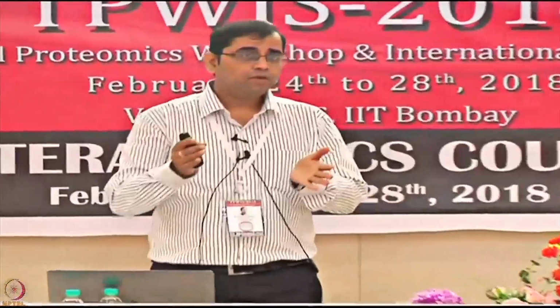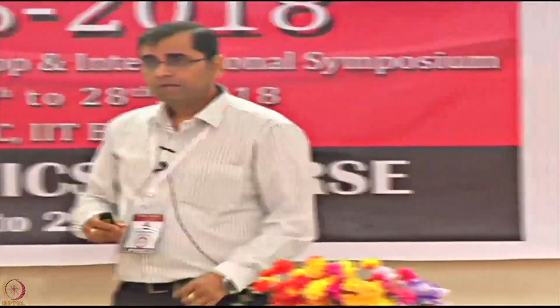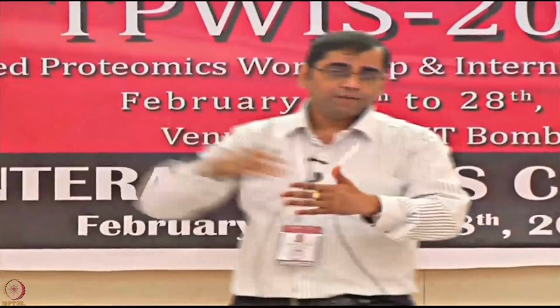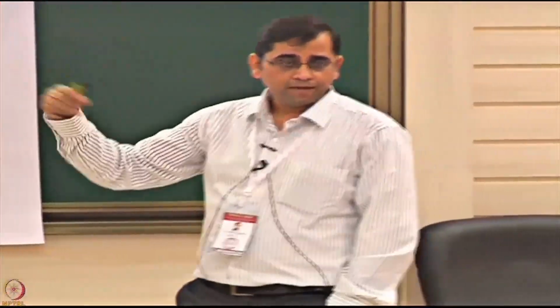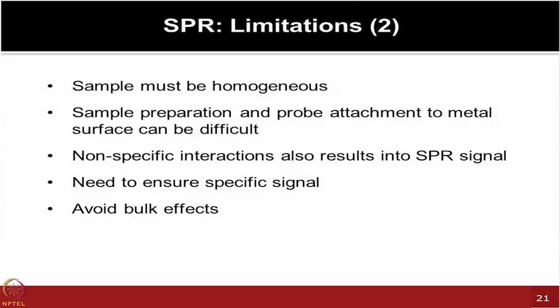So, I am sure you are aware of the different flow cells involved in the Biacore experiment, for example. One flow cell you can just block, which can be used for your QC checks for many experiments, and you can vary the other flow cell for testing your unknowns. Therefore, you will still have full control as you are going along: the chip has not gone bad and the molecules used as positive controls are behaving the same way.